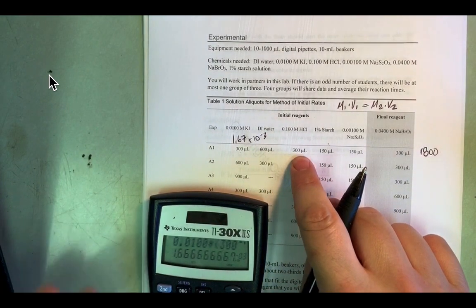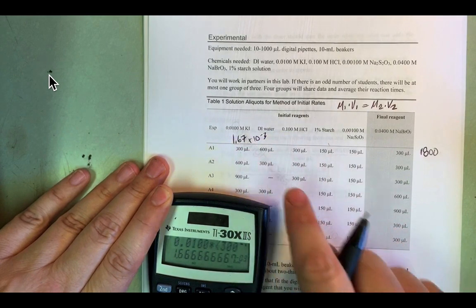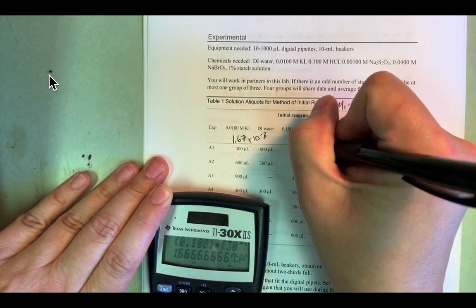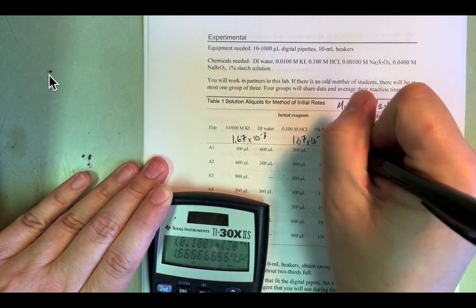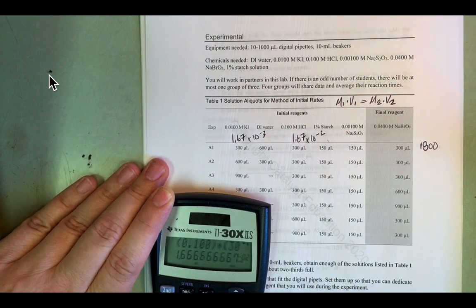Here's another one. Okay, the bottle concentration is different though. Our bottle concentration here is 0.1 rather than 0.01. So let's put that one in the calculator too. 0.100 times 300 divided by 1800 is 1.67 times 10 to the minus 2. Okay, it's minus 2 because this acid is more concentrated than the KI solution was by a factor of 10.